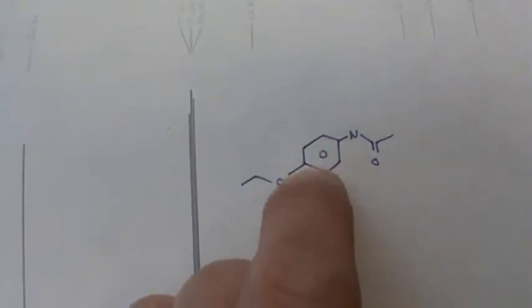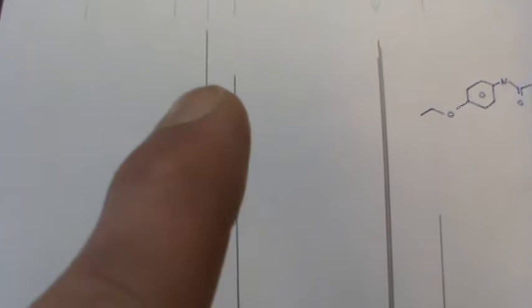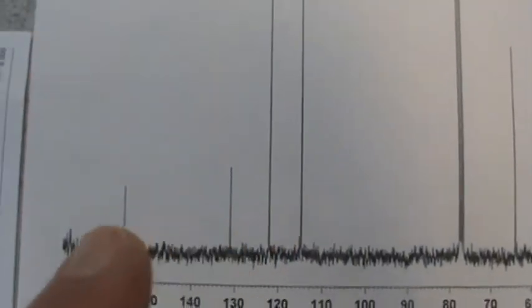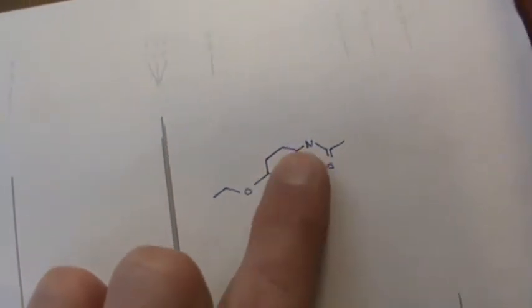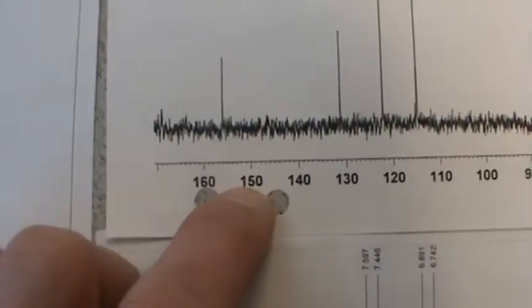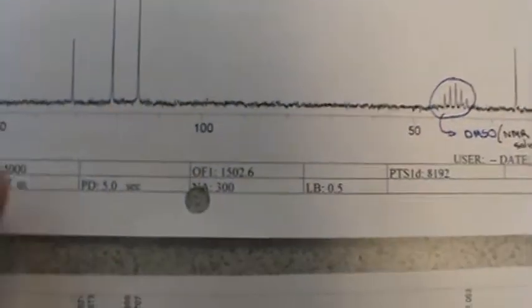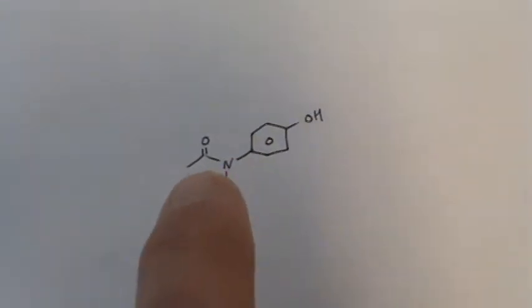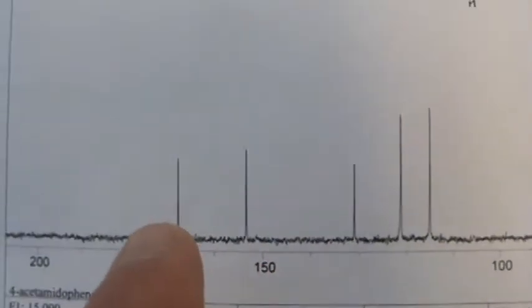These two ortho carbons and these two will be taller in the aromatic region. So you will see two taller peaks that clearly have to be those. You see two shorter ones, which normally would be the attachment carbons. That amide one, I'm pretty darn sure has to be past 155. When you look at our starting material's amide, do you see how the two para attachment carbons were here? And then the other amide one was actually way out at 167.